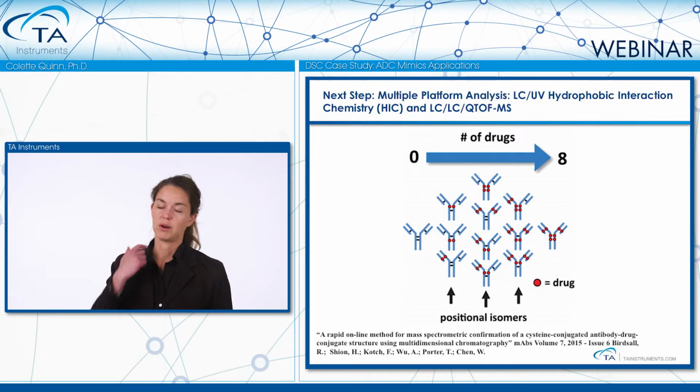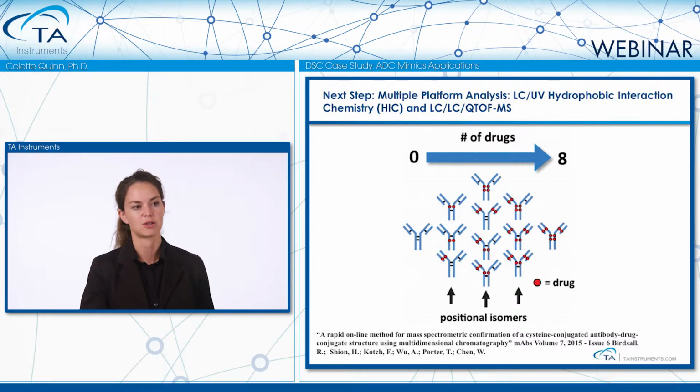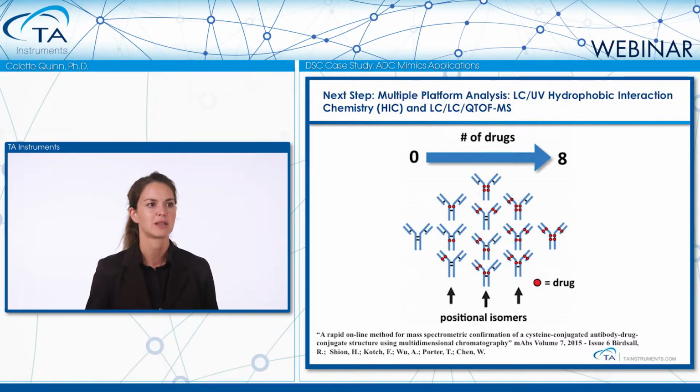What do you do next, or what did you do first? One of the ideas, because of my association with Waters, would be: what would Waters do in this kind of assay, or how would they assay antibody drug conjugates? And they actually have a very nice recent paper talking about the next step, looking at a multiple platform analysis. They did an LC-UV hydrophobic interaction chemistry, or HIC chemistry, with LC-LC QTOF-MS.